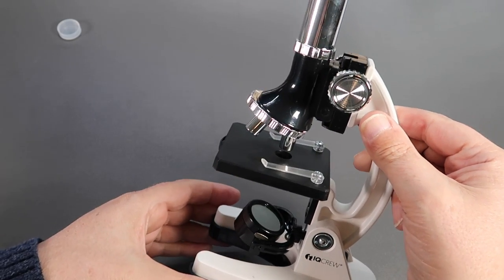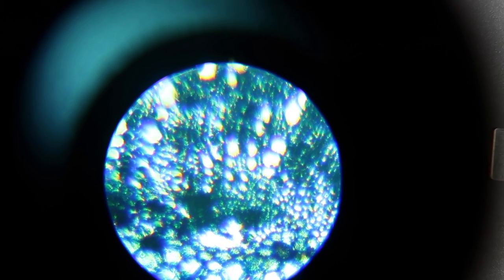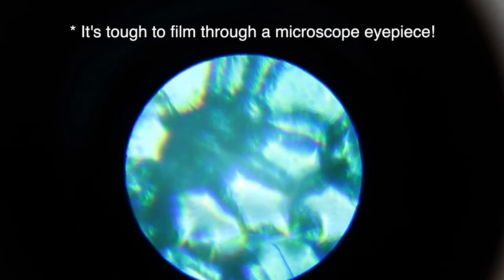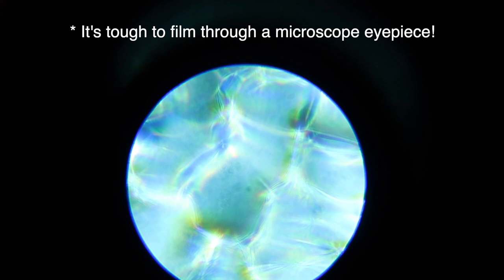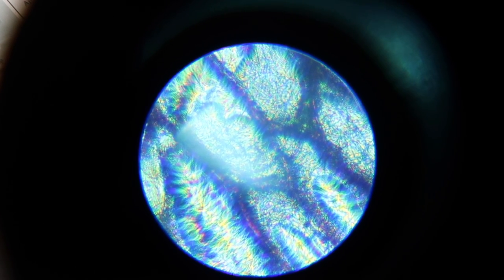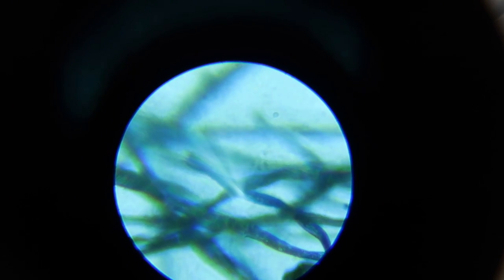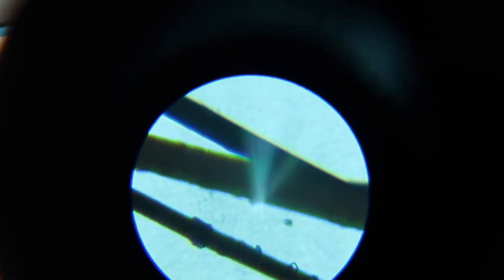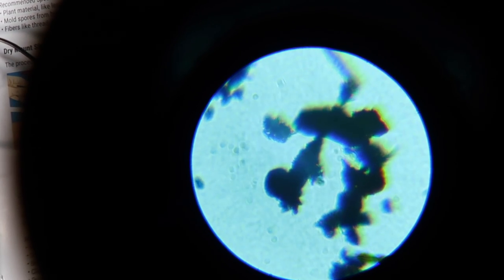So I tried out some of the fixed slides. This is an onion bulb. This is a cotton stem at 300 magnification, and again at 600. Here's a goldfish scale. A broad bean leaf. And finally an onion bulb. Here's a bundle of fibres from my sweater. Here are a few strands of cat fur. And here's some dirt from our flower pot.